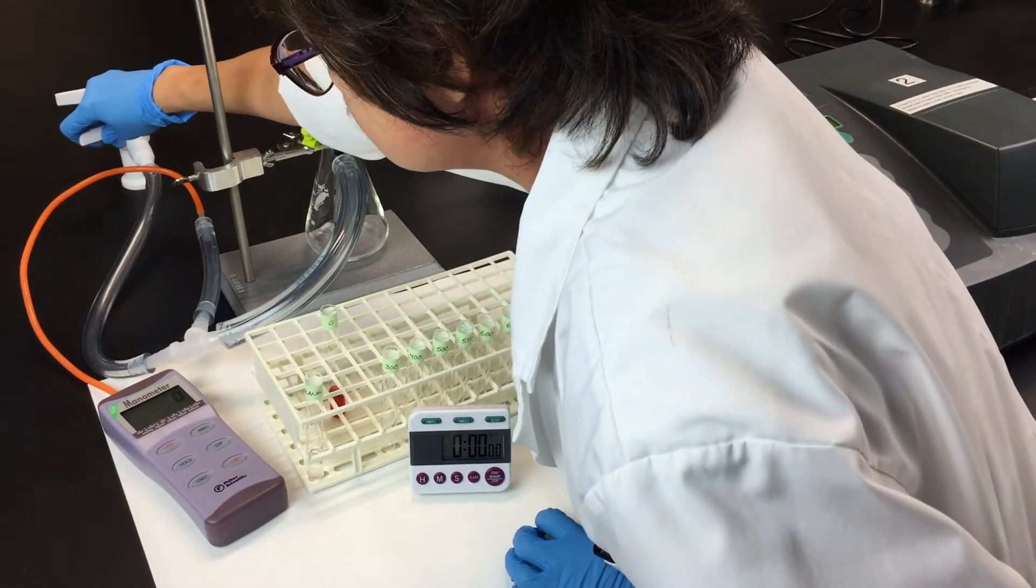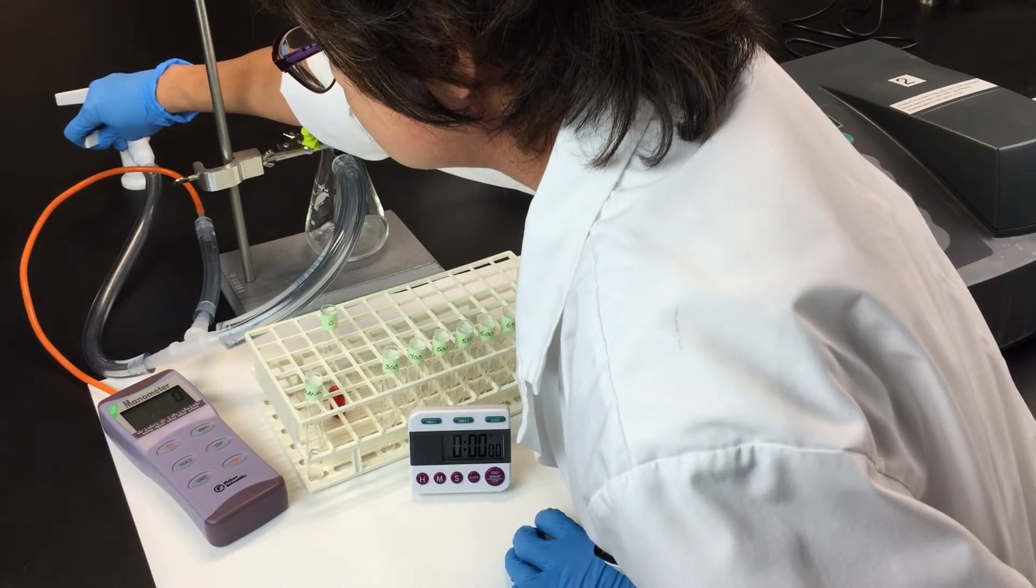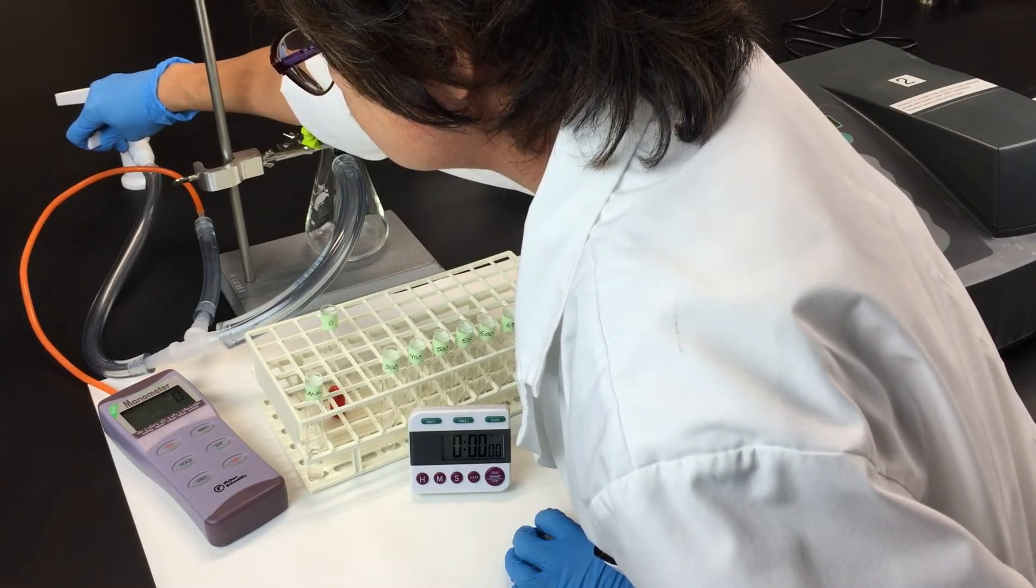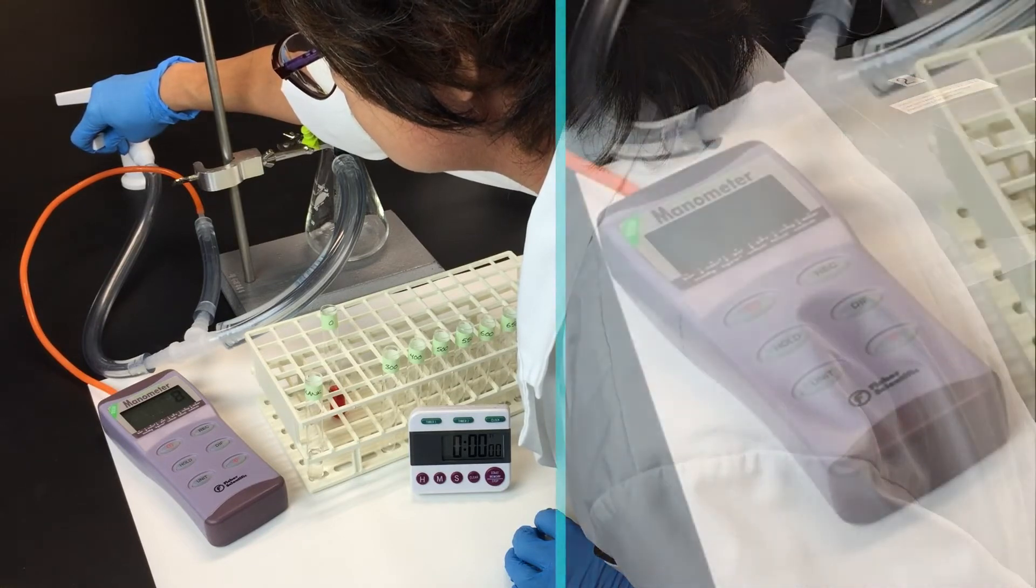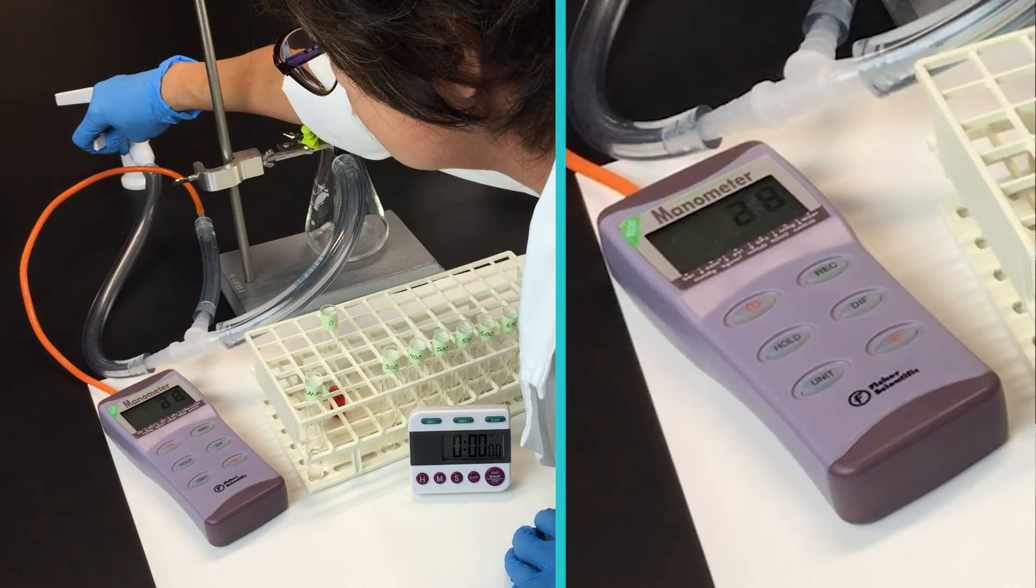Now slowly open the vacuum and increase it to 300 millimeters of mercury. You want to do this slowly and carefully because it's very easy to overshoot your target vacuum pressure.